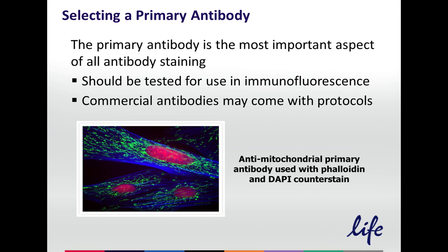Also, there are a lot of different commercial sources. We have an antibody selection tool for primary antibodies on our website at lifetechnologies.com. There's also some other general websites that you can go to, like linscottsdirectory.com, as well as biocompare.com.